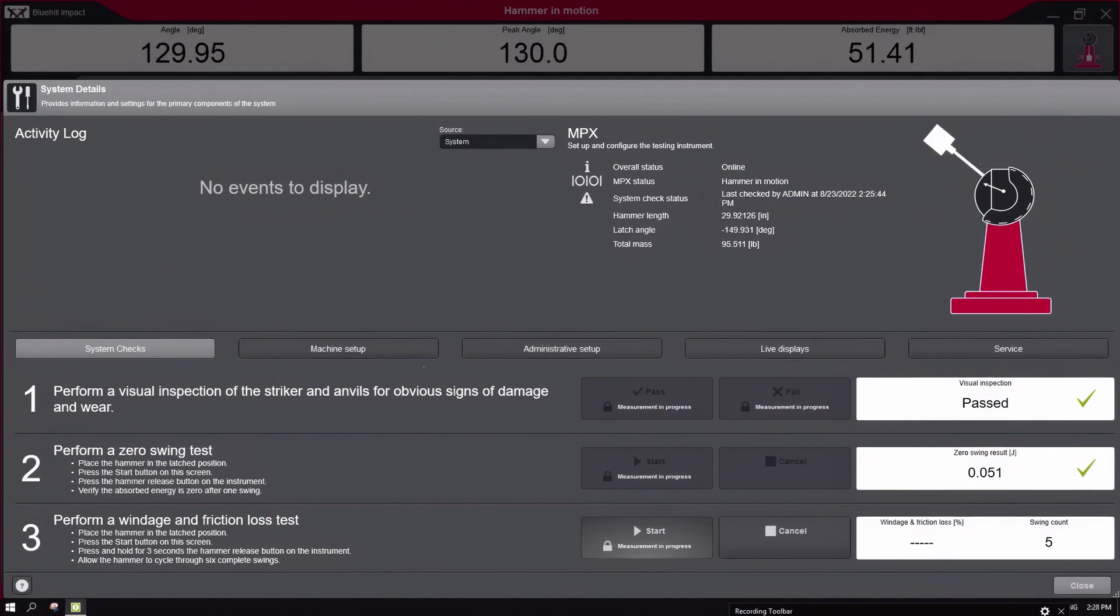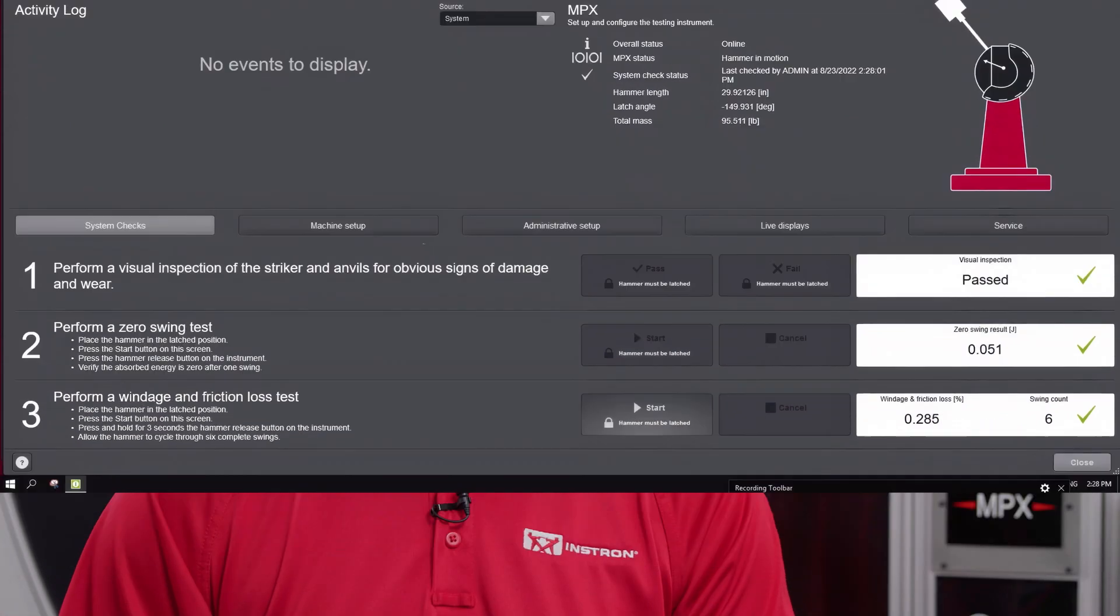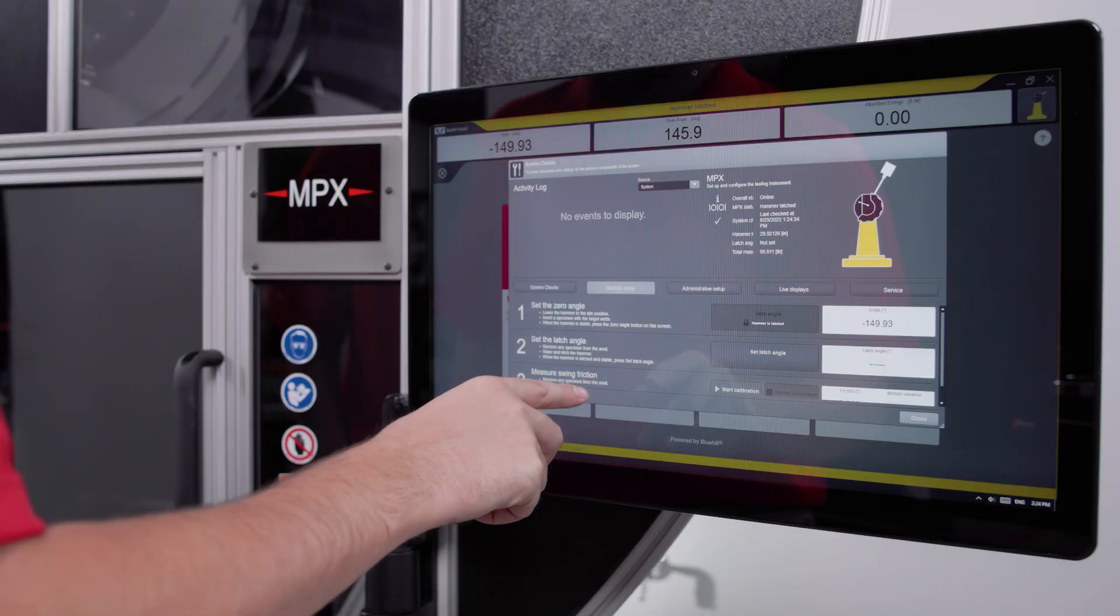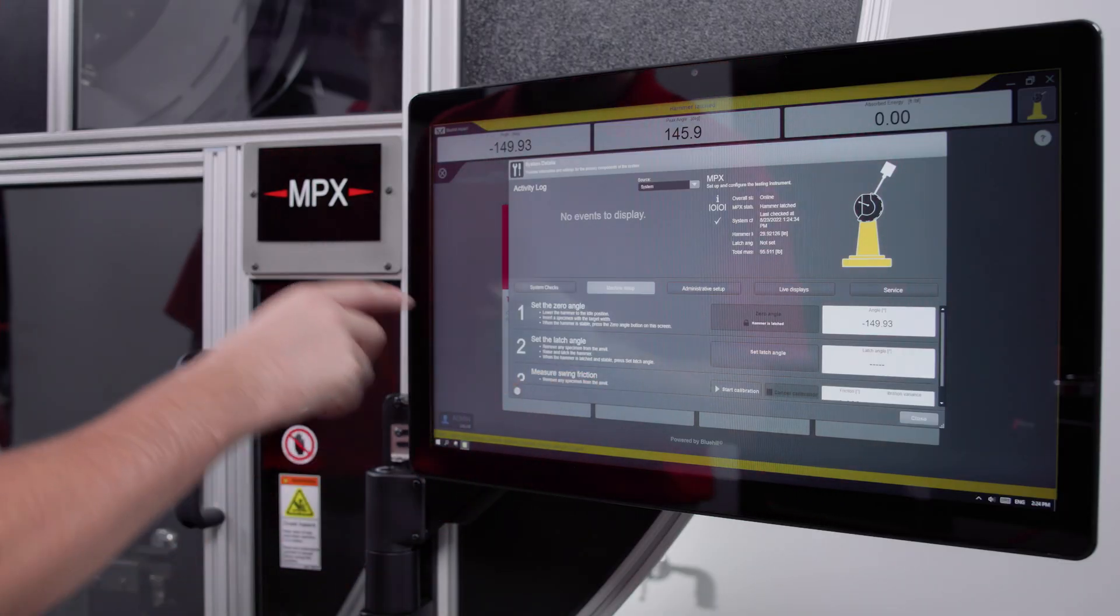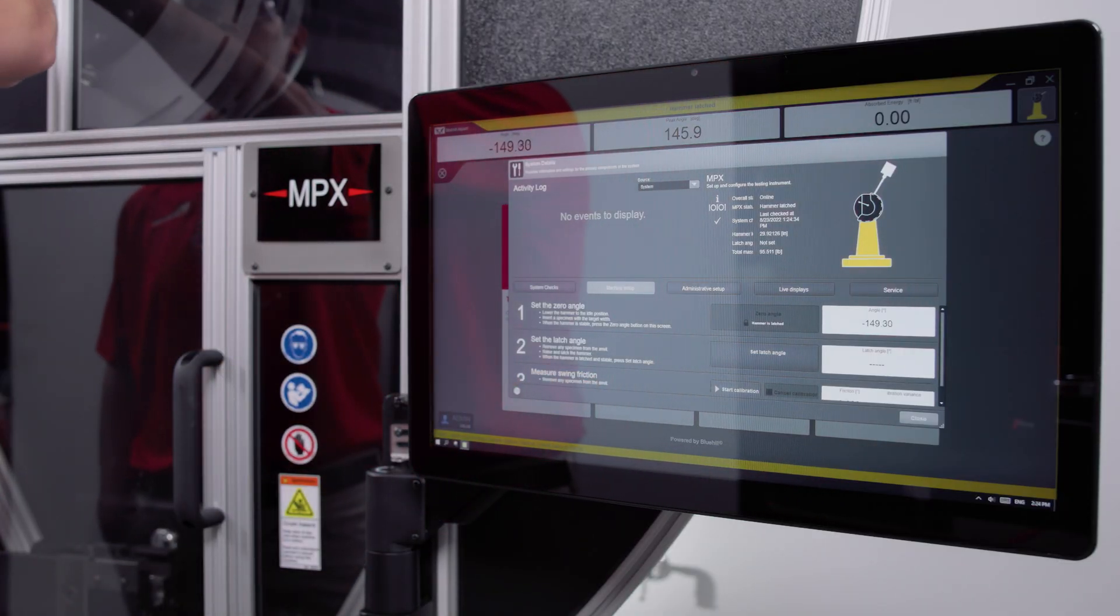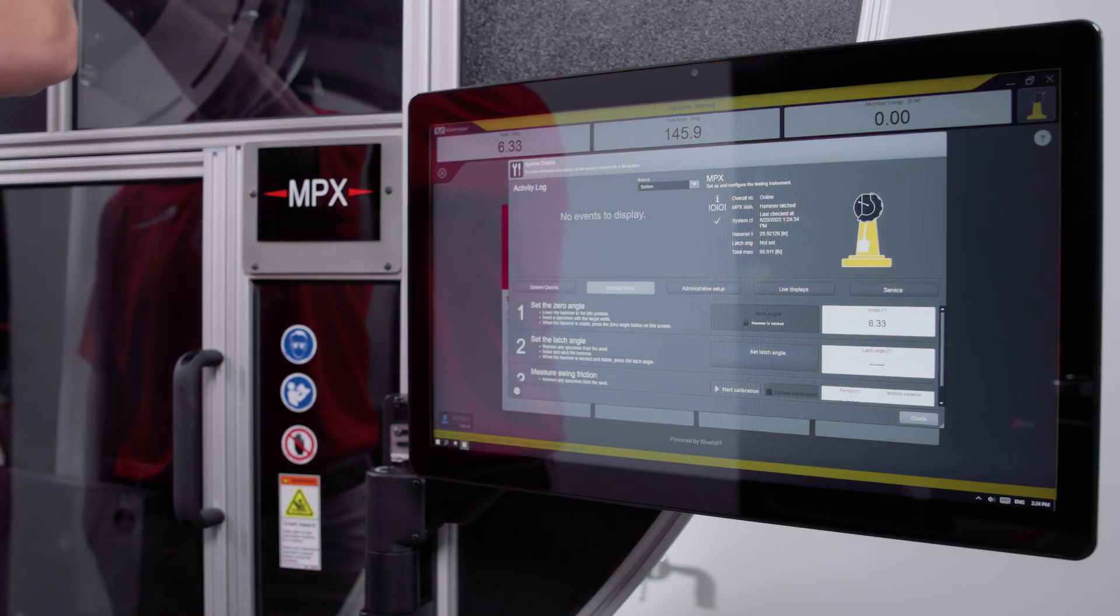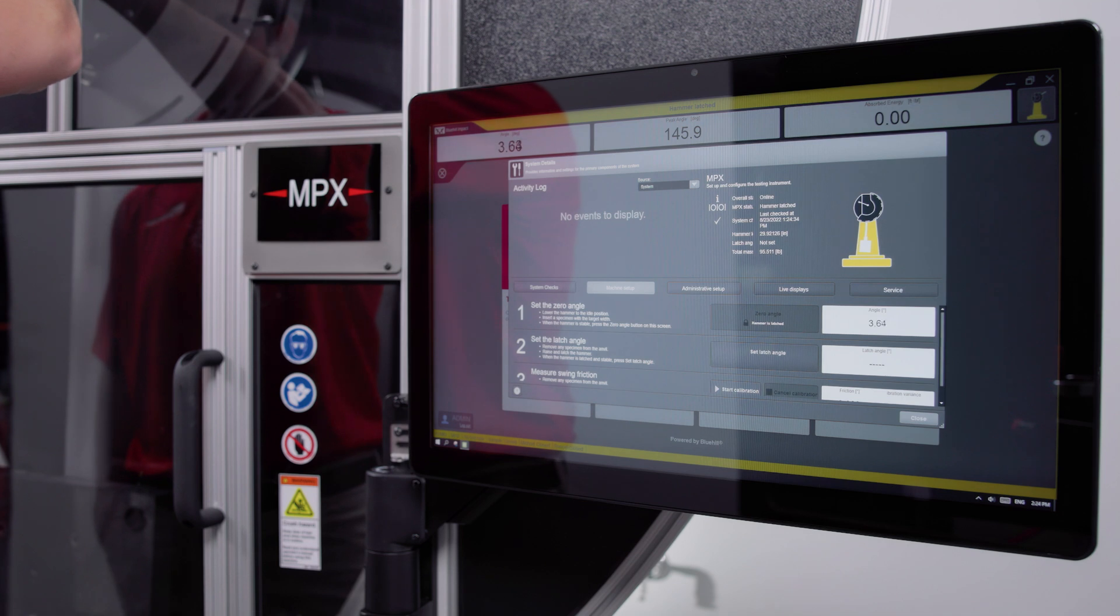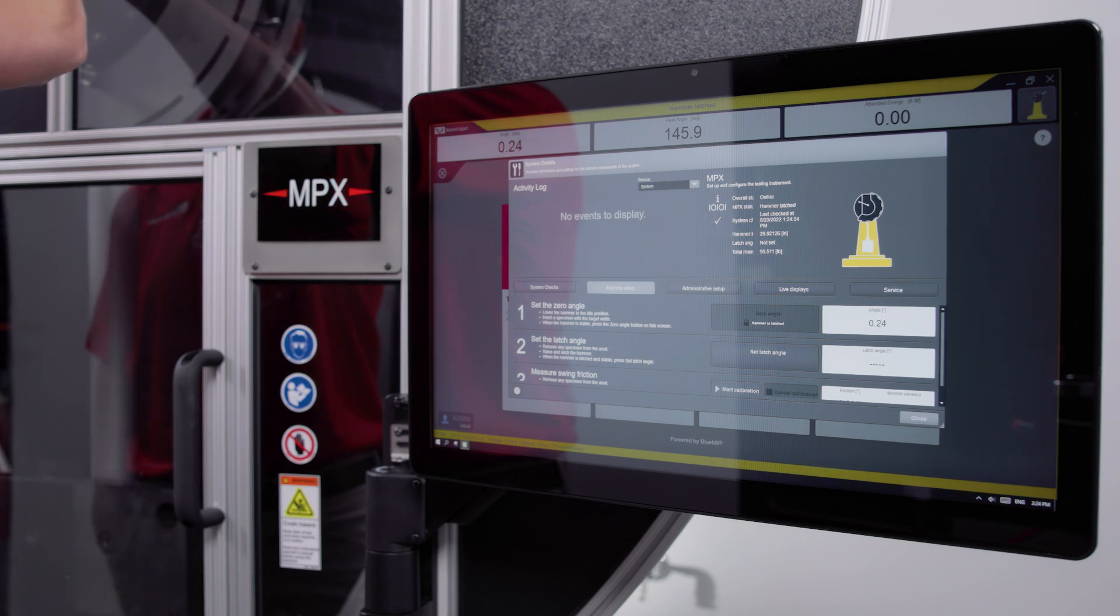If your system passes all checks, the operator can begin testing. Should something fail during system check, you would go through the machine setup dialog, which provides additional guidance for calibrating the MPX. This soft calibration can be done without requiring a technician to come out for a full service outside of your regularly scheduled Instron visit.